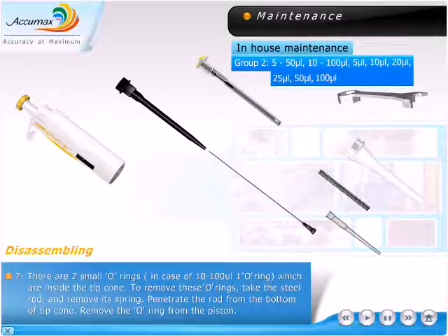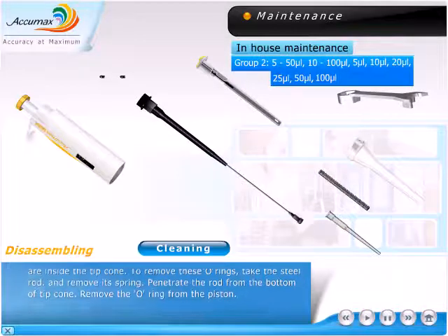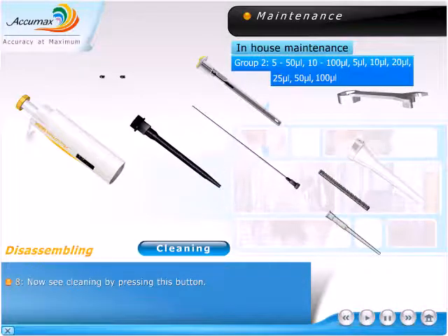There are two small o-rings in case of 10 to 100 microlitre, one o-ring, which are inside the tip cone. To remove these o-rings, take the steel rod and remove its spring. Penetrate the rod from the bottom of the tip cone and remove the o-ring from the piston. Now see cleaning by pressing this button.